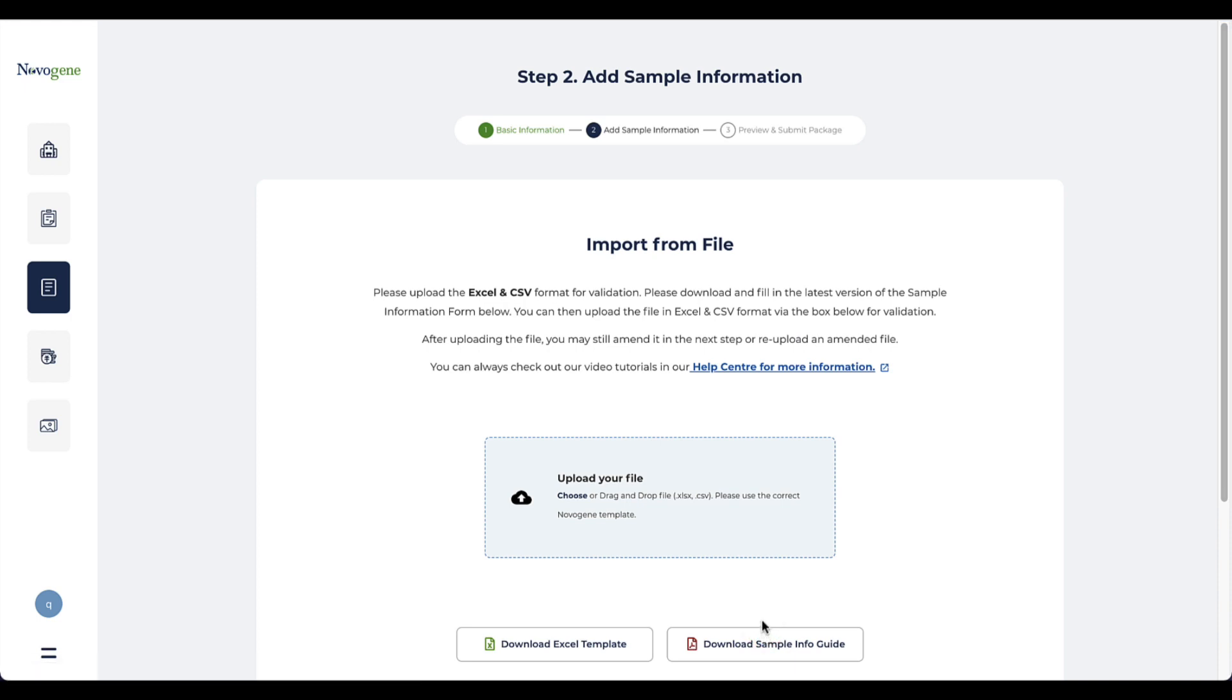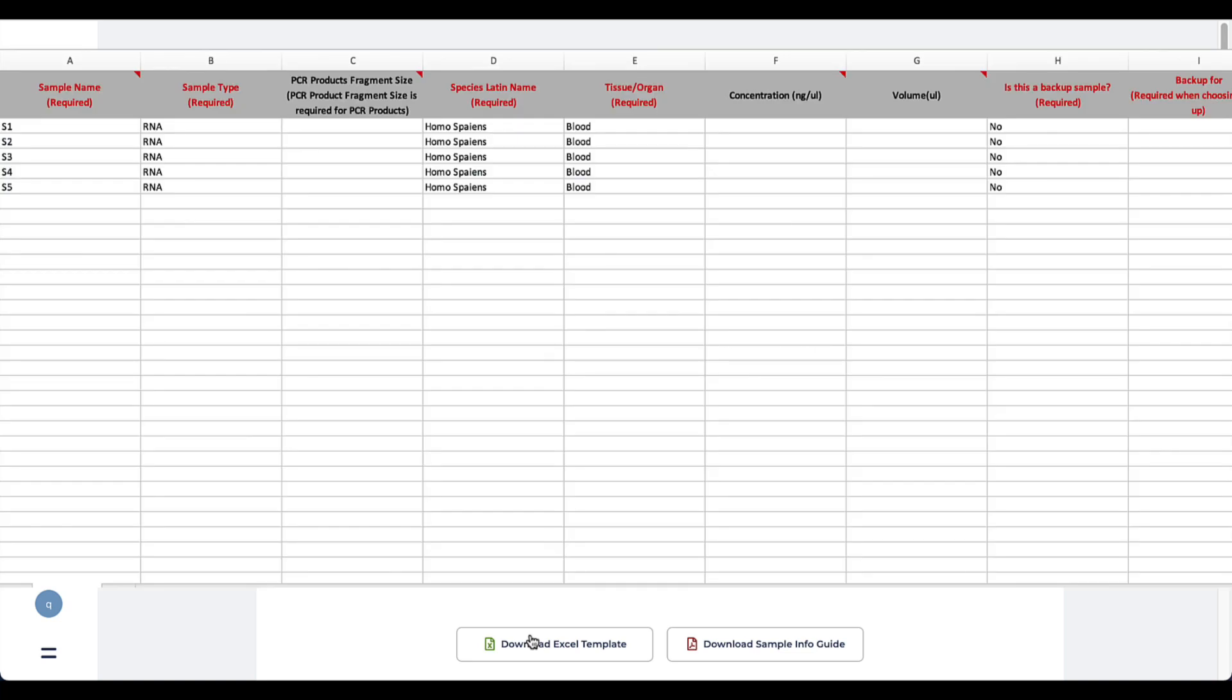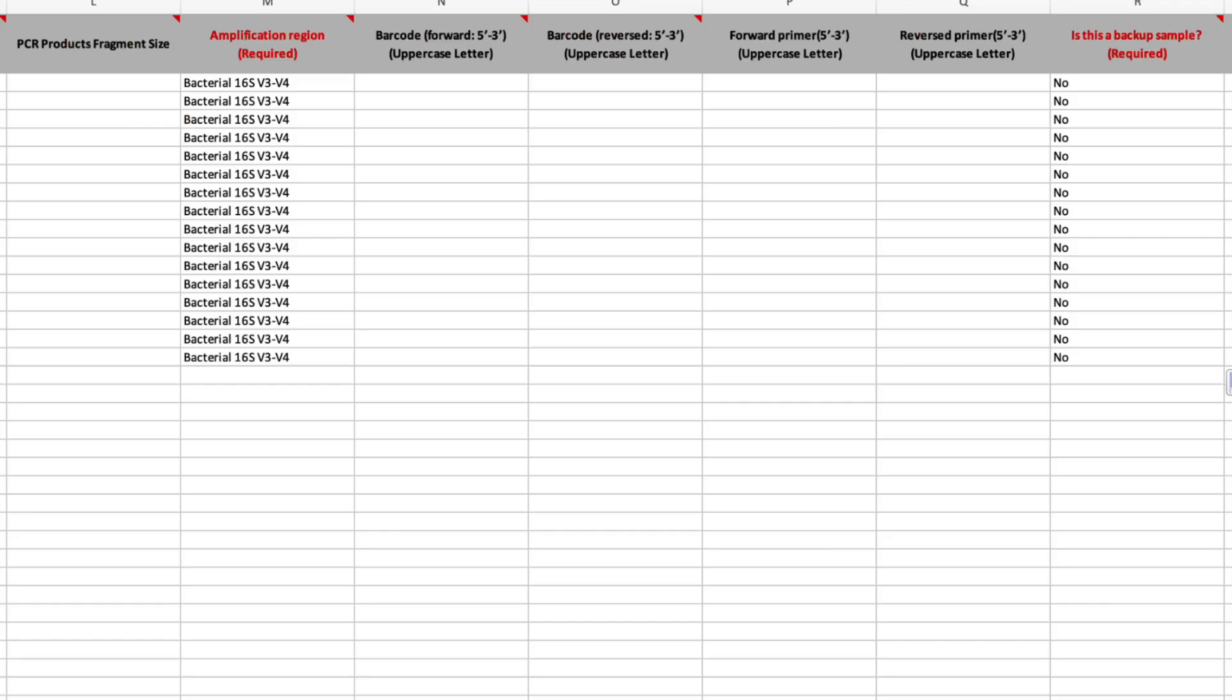In step 2, you can download an Excel template to fill in the sample information. The concentration and volume are not required here. The measurement is included in our standard QC process. If your project is Amplicon-based metagenomics related services, except for the basic information, you may also need to let us know about additional information like Amplify region.